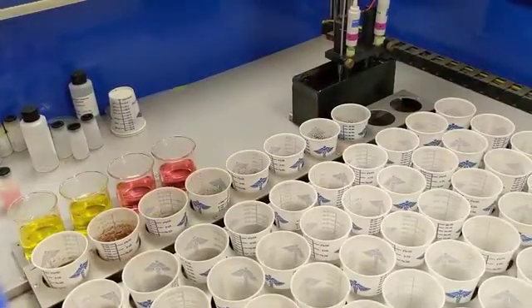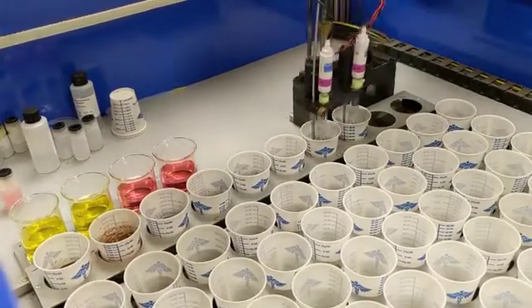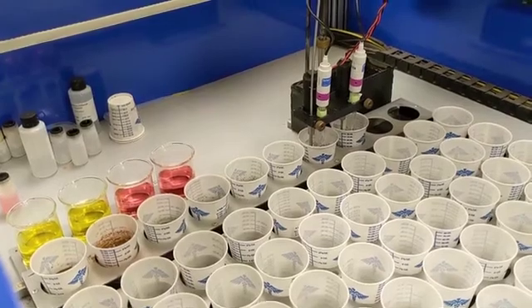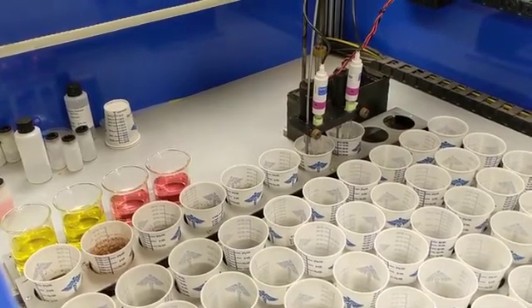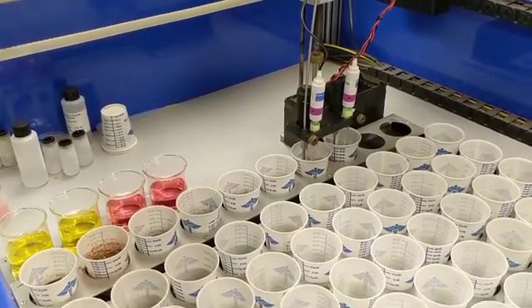After calibration, the analyzer is ready to run. Here you can see the automated dual probe system taking two pH measurements at once. Along with our check samples, we also have duplicates of samples within the set being analyzed. These duplicates allow us to monitor the accuracy of the pH analyzer.